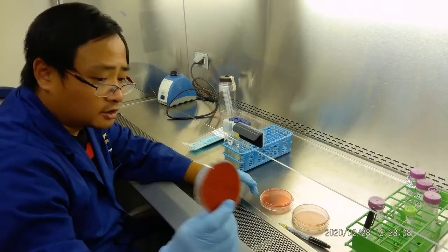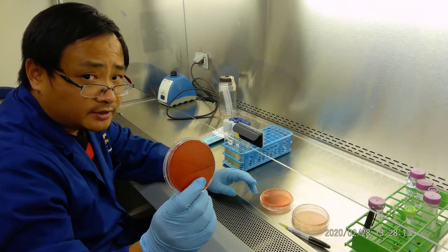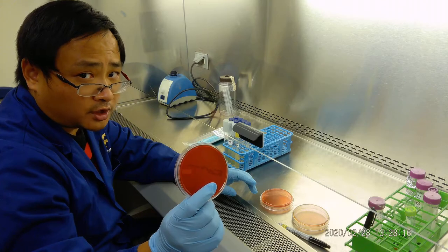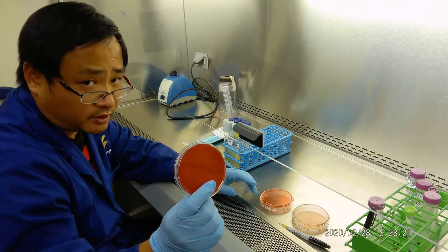Now blood agar, which is a trypticase soy agar with 5% sheep blood. This will be an enriched media. Bacteria can grow dramatically. Also, we can differentiate based on beta hemolytic and alpha hemolytic.